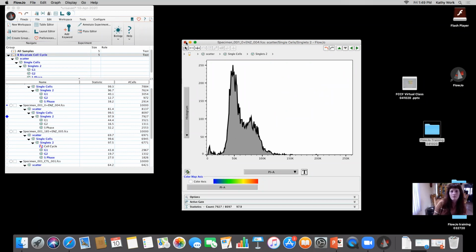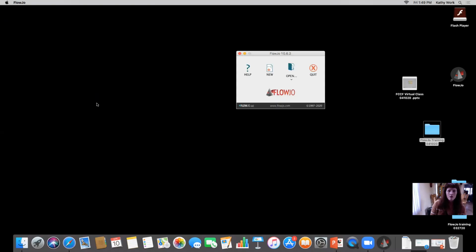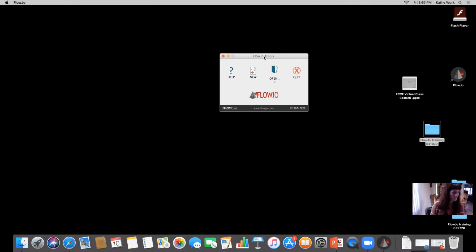But what I'm going to do is I'm going to actually ask Rui's advice on that one. So do you think we should see that data set, or should we move ahead to proliferation given the time? I think unless people ask for that, I think we should probably move on. Right? Okay. Can I just ask you a couple of questions?